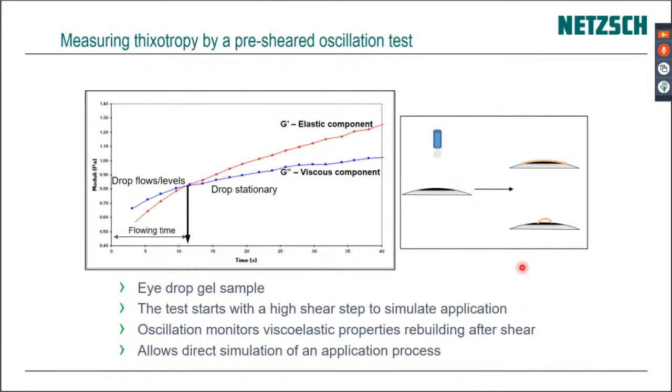So this is a very good simulation. If you're doing an oscillation test with time, you can see it's a viscously dominated material and then thickening up to an elastically dominated material over time.